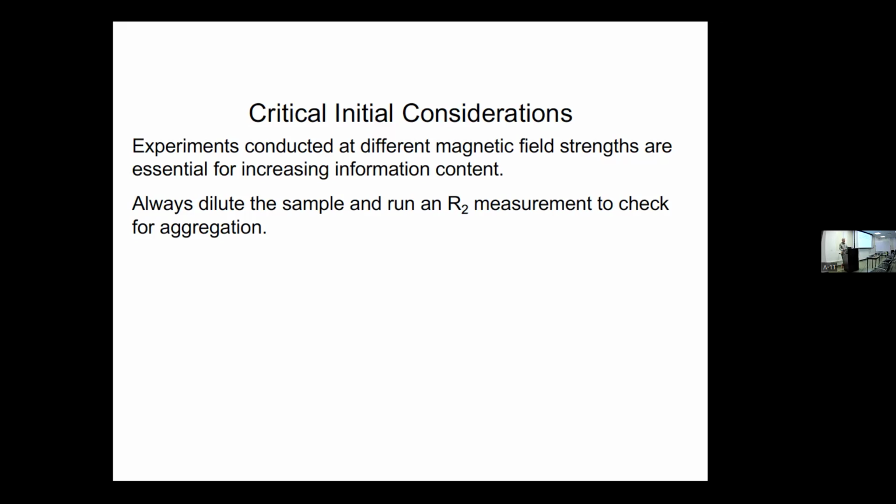And of course, if you're thinking about doing temperature dependence of dynamics to try to get ideas about activation barriers, etc., the aggregation is also likely to be temperature dependent. So the amount of perturbation caused by the aggregation becomes a function of temperature, and can really swamp what it is you're trying to find.